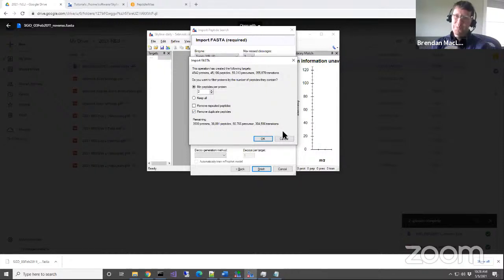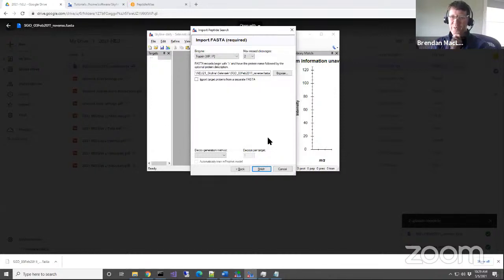And you can choose to be broader than that if you want, but I'm not going to do that. I'm going to stay with one and not remove duplicates so that absolutely everything gets passed through, and we'll filter it later. So just click OK. Don't do what I just did, and we're going to move on.